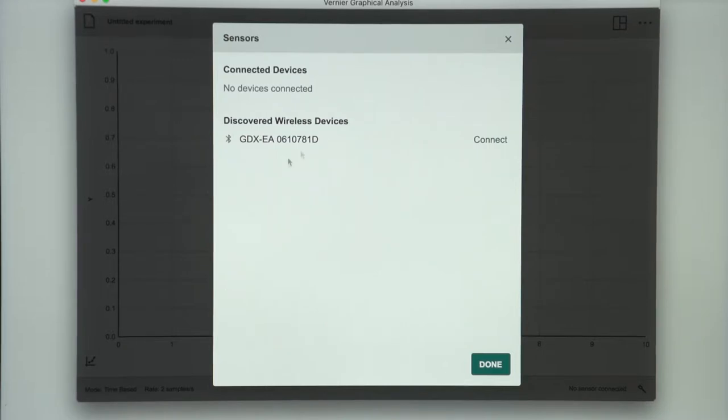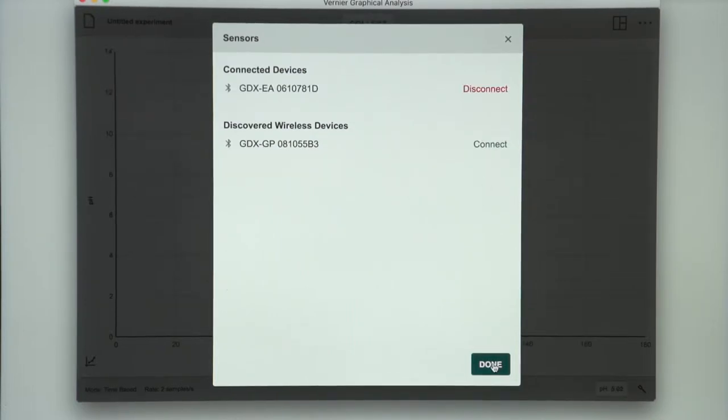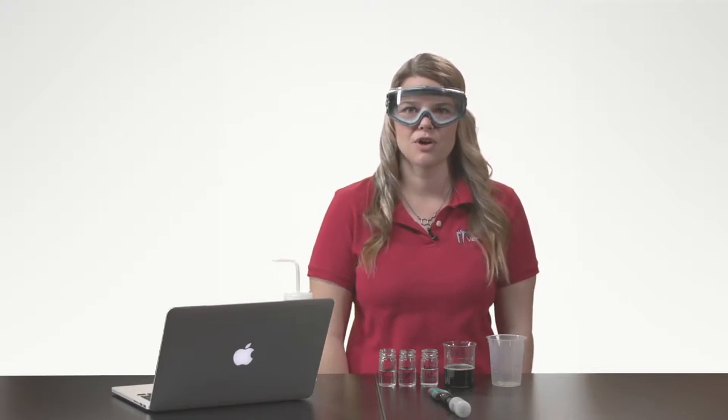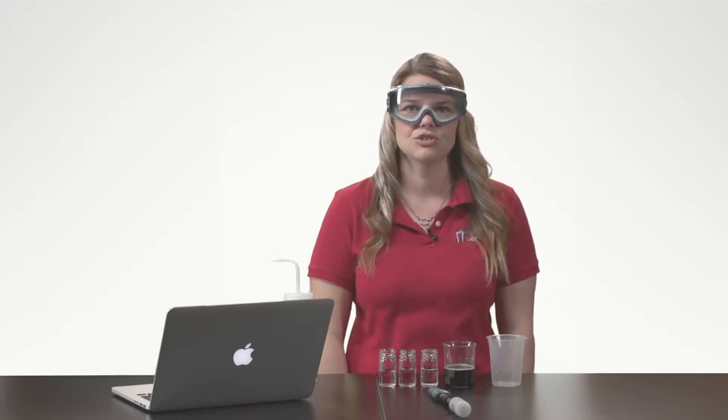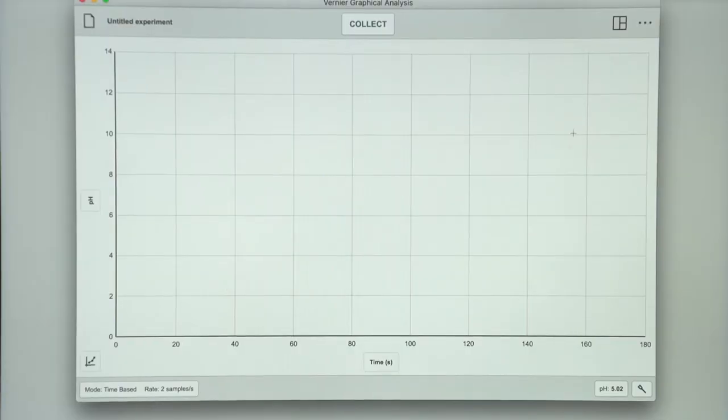I will then connect my pH electrode and select Done. For this experiment, I want to be able to read the pH value from the sensor and record that reading in my laboratory notebook. This requires changing the screen to the meter screen. To do that, I tap on the square icon and change the view to meter.